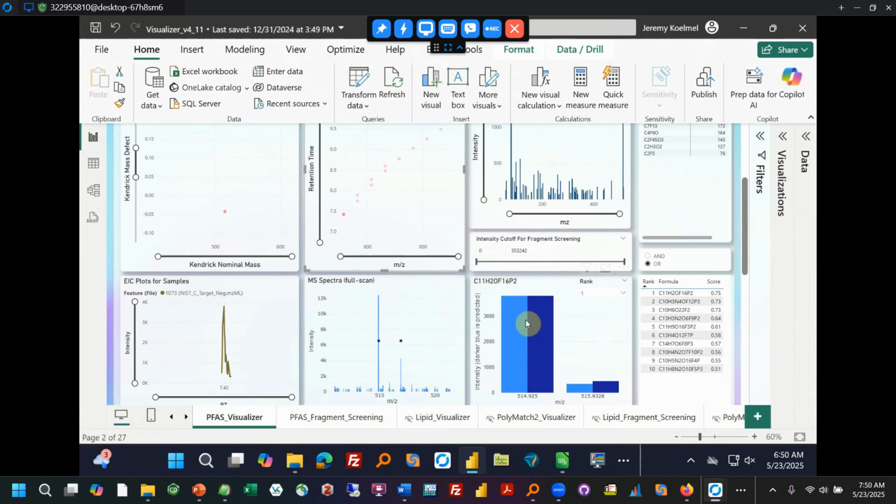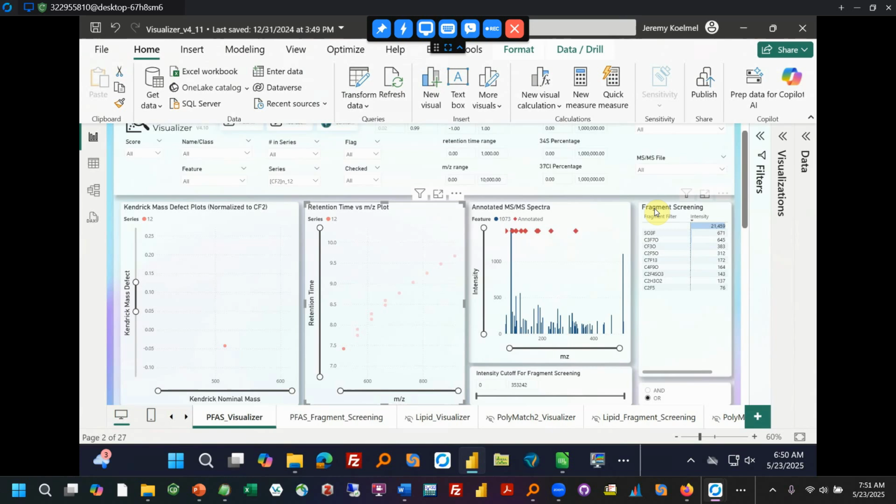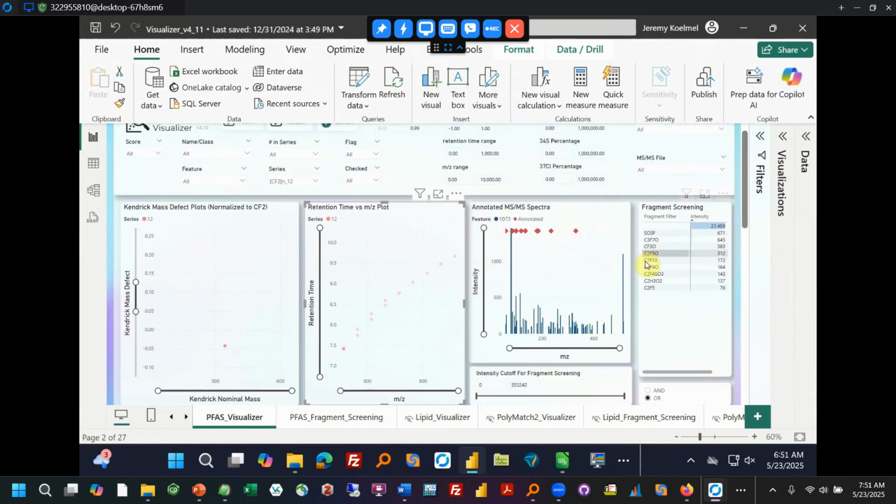Here's your isotopic pattern. So again, in this case, it didn't get the right formula for any of the top 10, and yet this may be some noisy, pretty low MS1 spectra, and it's okay. The isotopic pattern looks decent for what I'd expect for this ether species, so even though the formula prediction didn't get it, I'm not worried. What I'm most importantly focused on is this MSMS spectra.